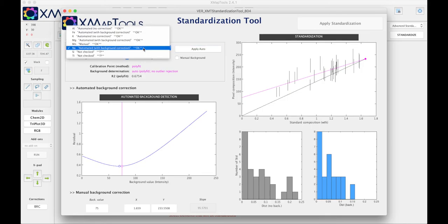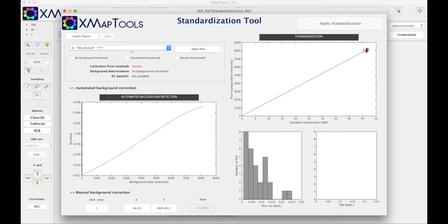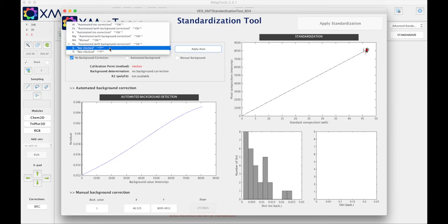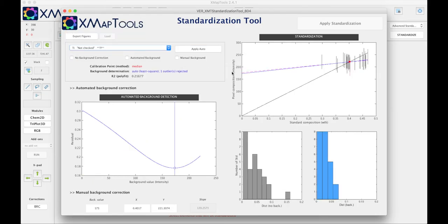I can just press apply auto and then silicon. Silicon we don't need any background correction because the count rates are really high for silicon in white mica. So I press apply auto.